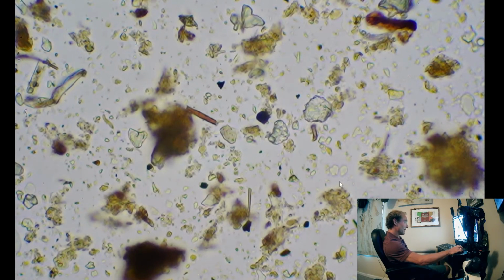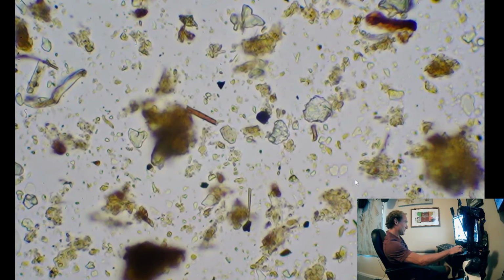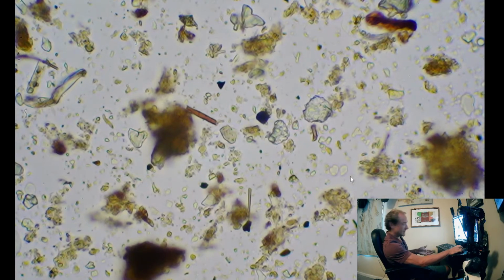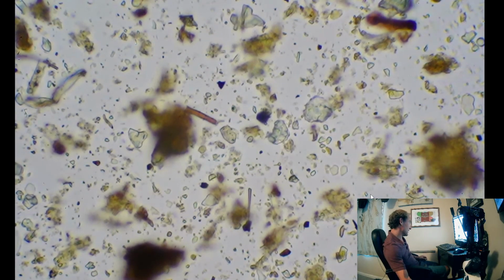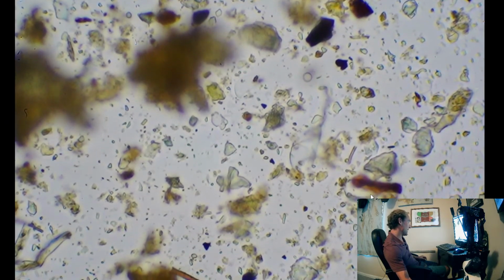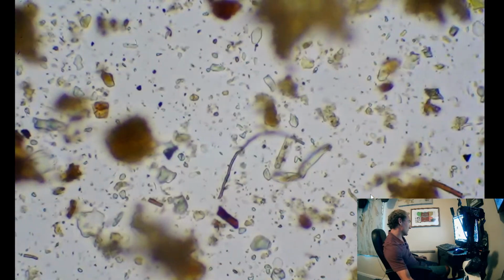Some of what I would consider more basic soils, lesser succession soils, actually seem to have a whole lot of bacteria, surprisingly enough. Sandy soils, what have you, bacteria really multiplies first. But what we're looking for is the diversity.